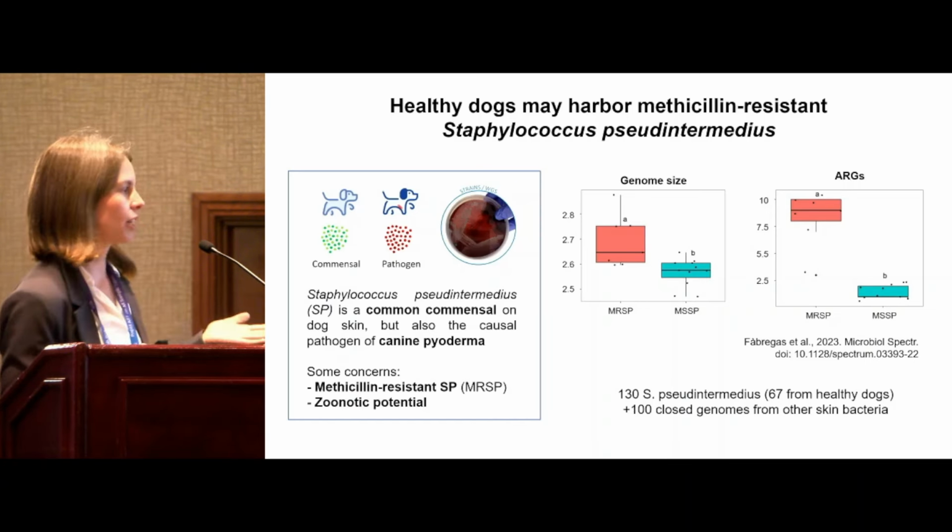For that, you can do it experimentally using some kind of Hi-C proximity ligation approach. We did that before with one sample, and now we are doing bioinformatics binning using SemiBin2, which was developed by Xiaojun in our lab, to bin all these long contigs into MAGs. So that's what we have right now.